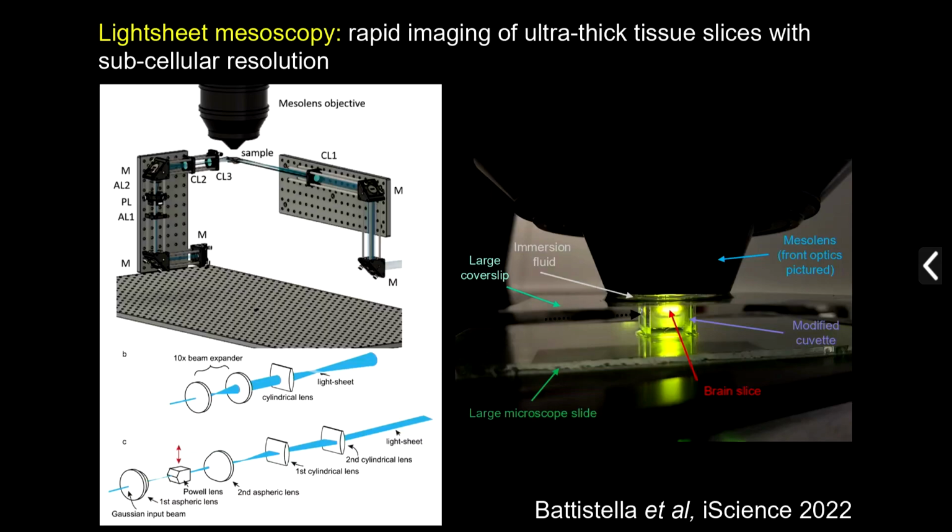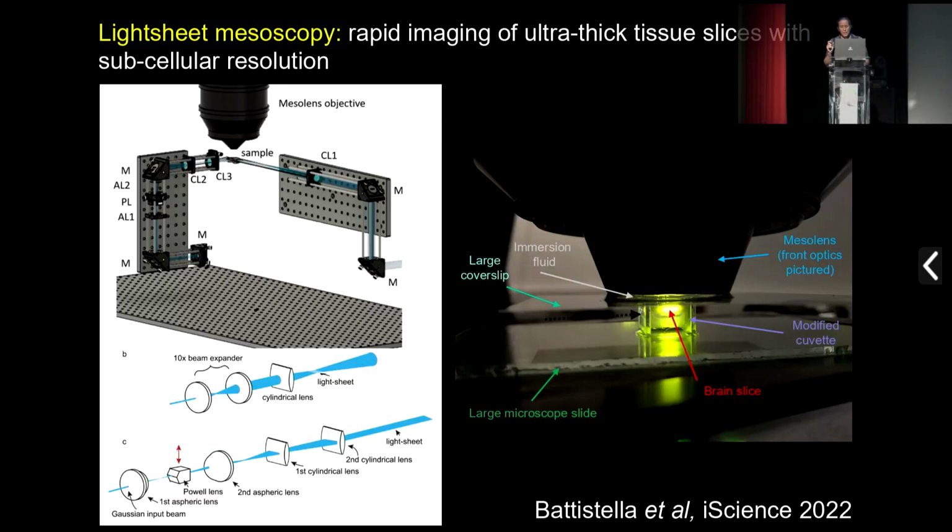So we approached this problem using 2 methods. The first one was to say, right, let's live with a thick light sheet. We'll have a 30 micron thick light sheet. It won't vary in diameter very much across that field of view, and we could use it for fairly crude sampling. So we've done that. The second one was to be ridiculous, and we've developed a non-Gaussian light sheet, so it's propagation invariant. It's about 4.5 millimeters long. It extends from about 10 micron at the exterior to about 8 micron in the middle. So it's consistently flat. We do this using aspheric optics and putting them off axis. This work is now published, but I'm happy to chat about it in more detail.